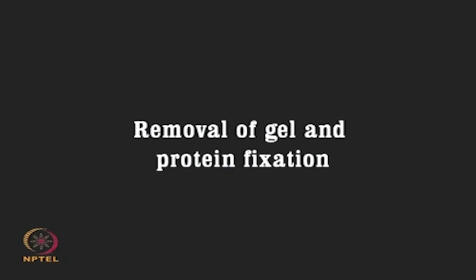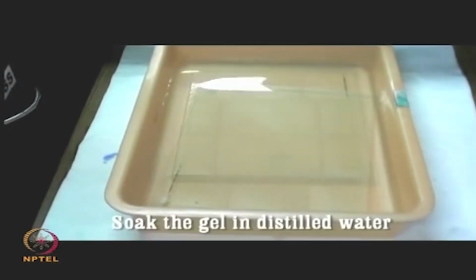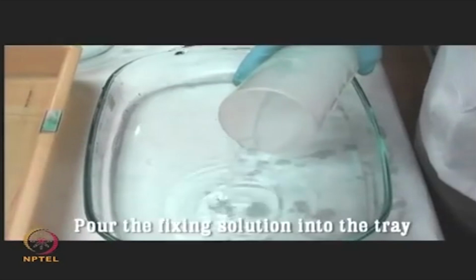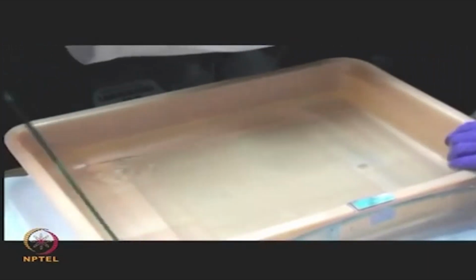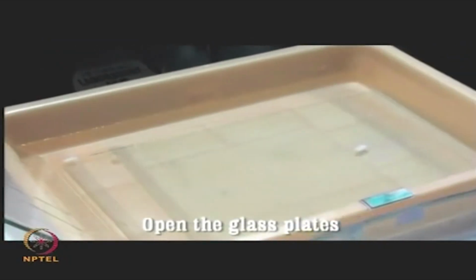Gel removal and protein fixation. Soak the gel present between the glass plates in fresh distilled water to remove any bound SDS. Pour the fixing solution containing methanol and acetic acid into another tray. Open the glass plates and carefully remove the IPG strip from the gel.